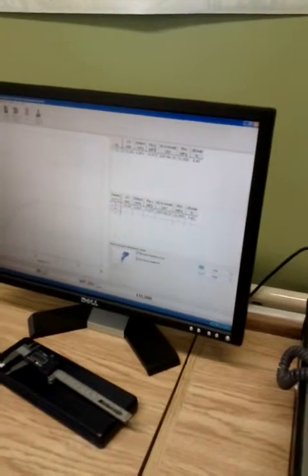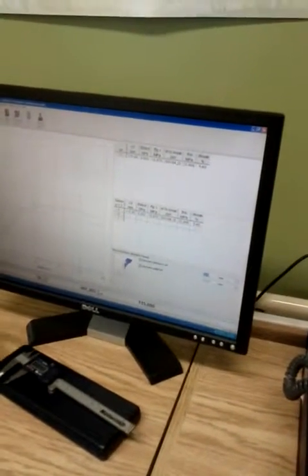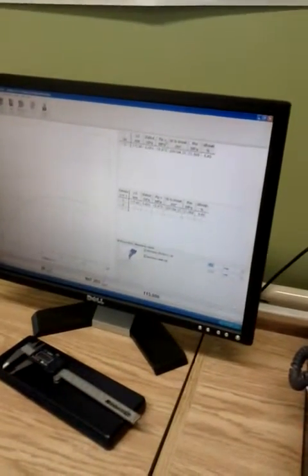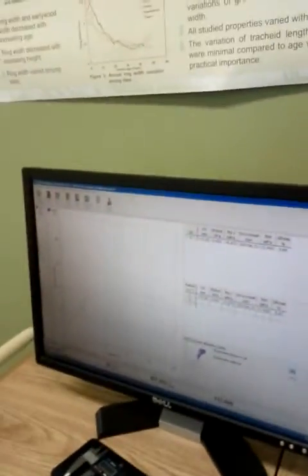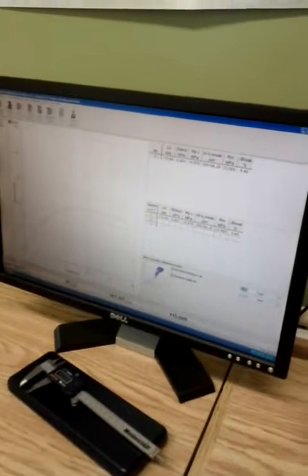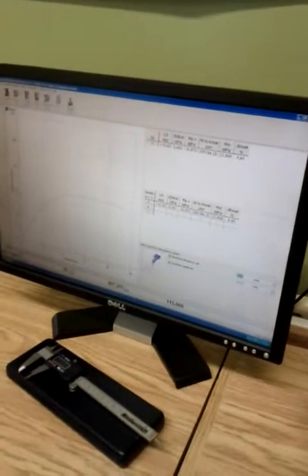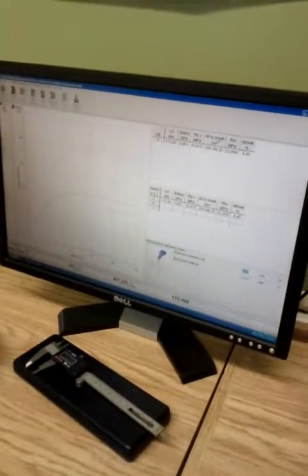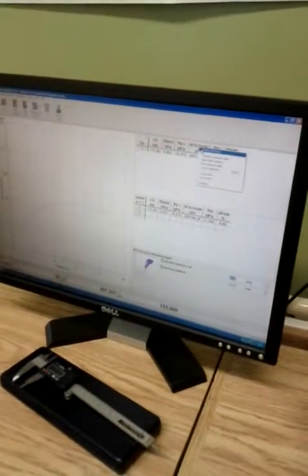RP is the tension, the yield point, yield stress. This is proportional resistance. X is, in my case, 0.2% plastic deformation. So you see it's about here. It's about where the linear part ends. So it's about 16. Well, and he put 90. It's about here. The work to break, or is it the work to?